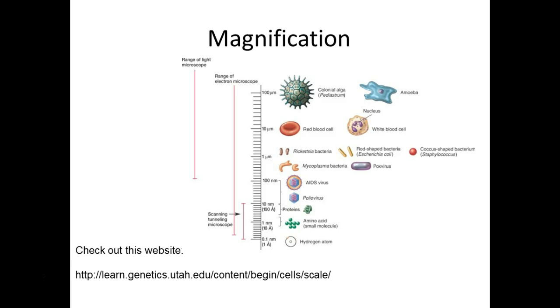Magnification, most of us have a pretty good understanding of this. This is not Honey, I Shrunk the Kids. We're not beaming something at it and we're not blowing it up. In that movie, he was shrinking things down. You're not actually physically making the object bigger. You're making the image of it appear larger than it actually is. Most of us understand how magnification works.